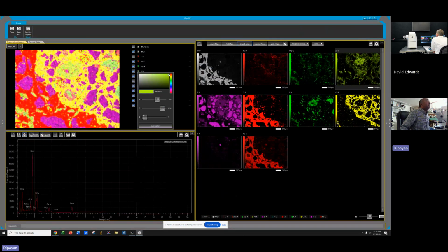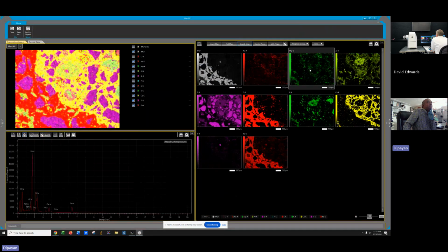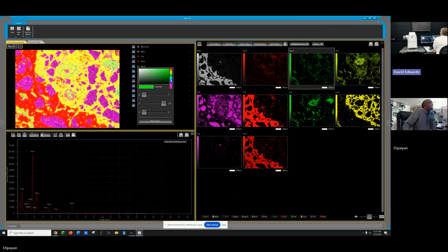Oh, you can make it brighter. Right. There's 6,000 combinations there. Okay. Yeah. I mean, the sky is the limit. So I can really play there. Yep. But I have to really choose wildly different colors here. I can't have the same kind of color show up. Three greens isn't going to cut it if there are different phases.